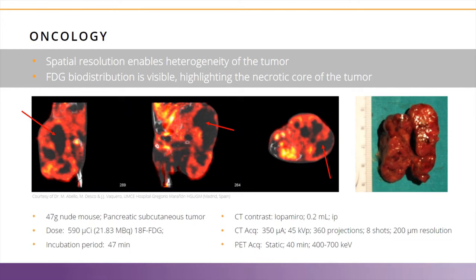On most of the images, you will see that I have added information about the animal model, injected dose, and agent used, along with image acquisition information. For those of you familiar with PET, you will quickly appreciate this information and be able to understand better the performance of the SuperArgus systems.